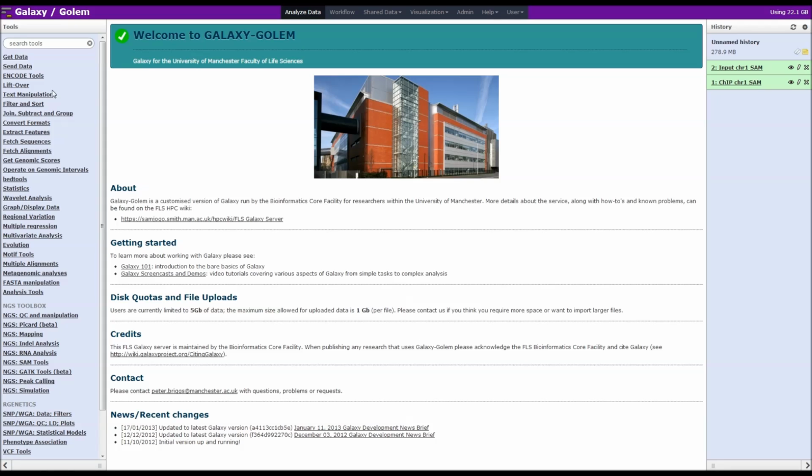So if this is left unchecked you'd be left with lots of false positive peaks in the peak calling step. So by using an input sample, which is basically just random DNA that goes into the ChIP protocol, you can subtract away these false positive peaks from those gained by the ChIP sample.